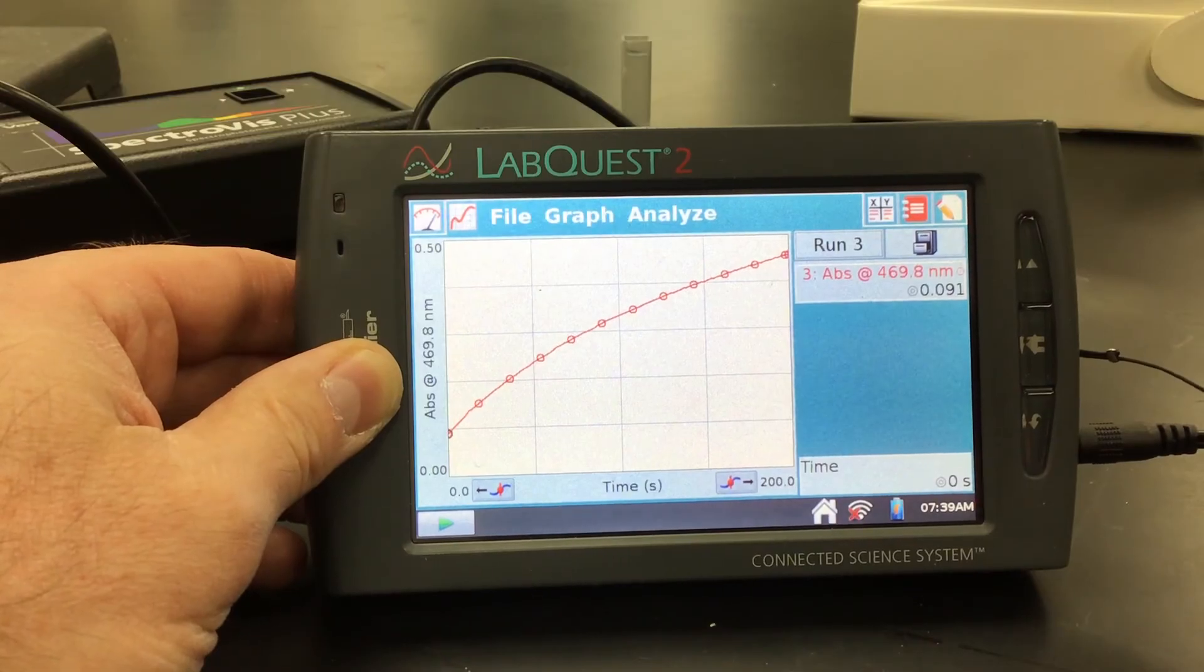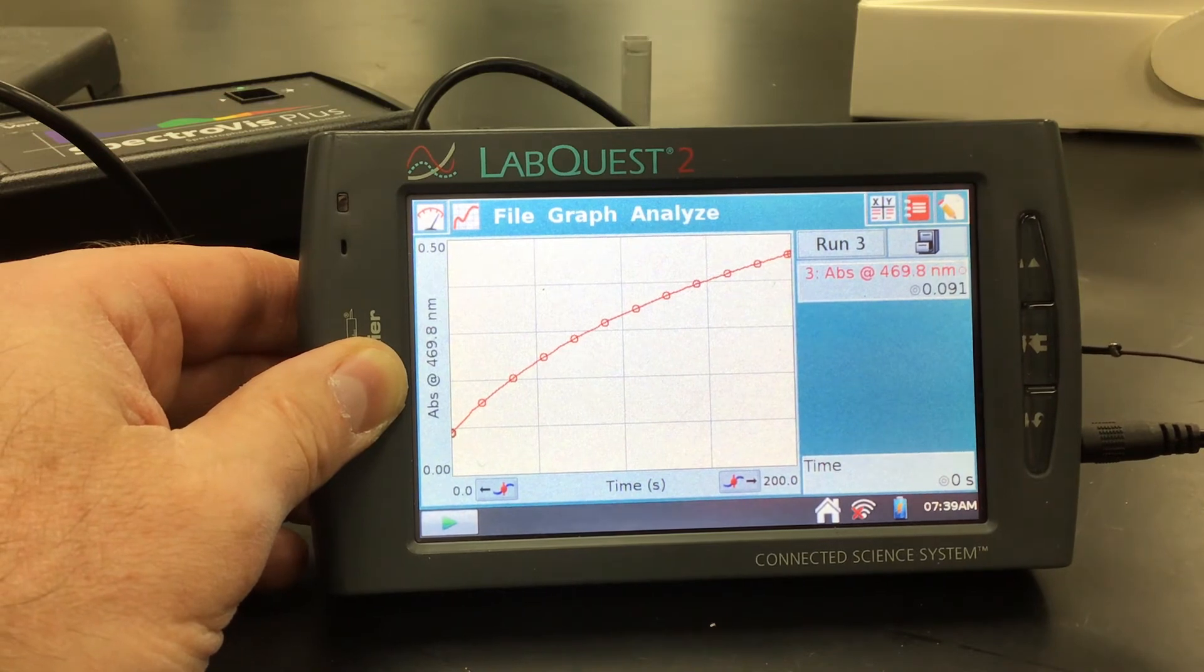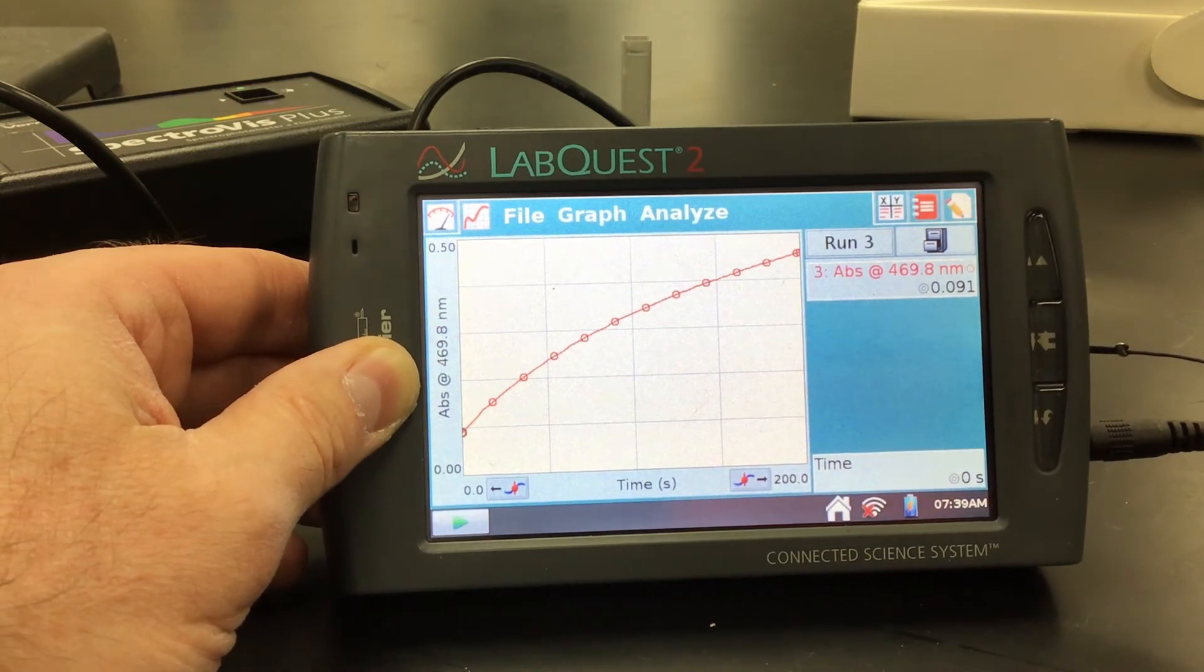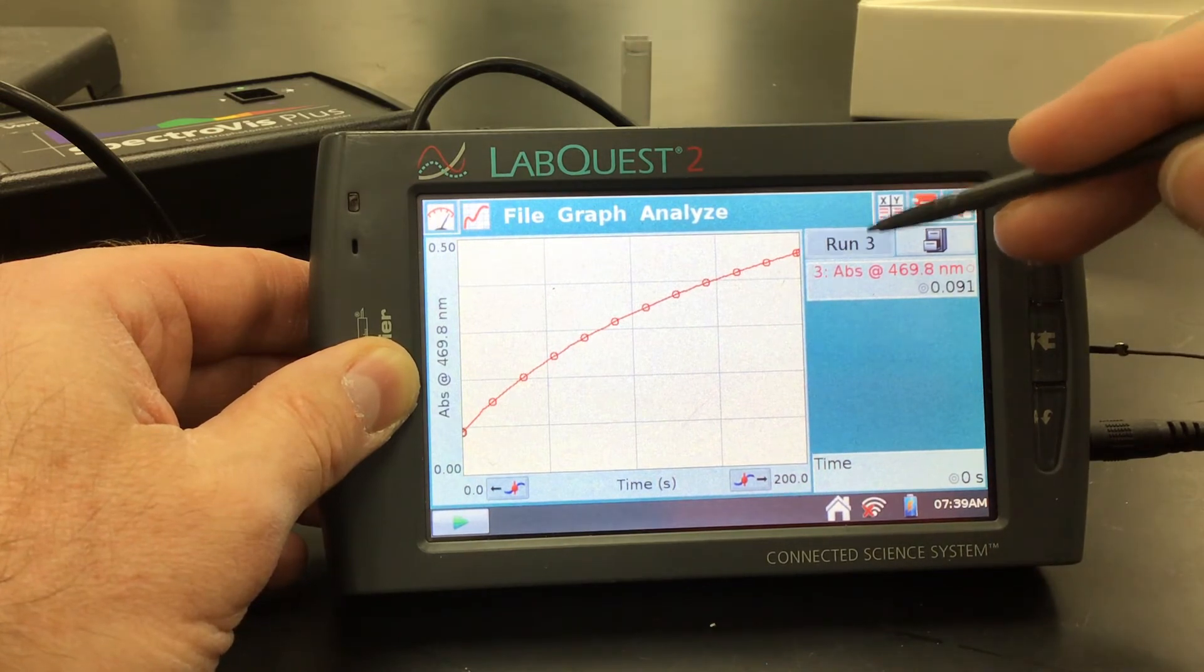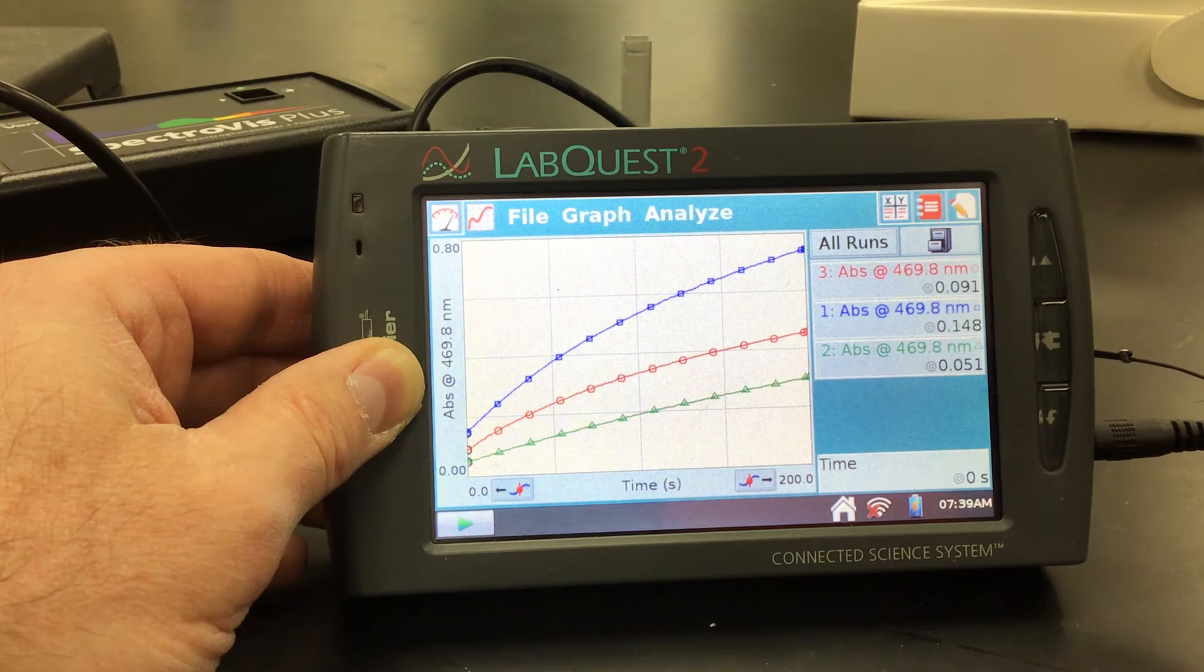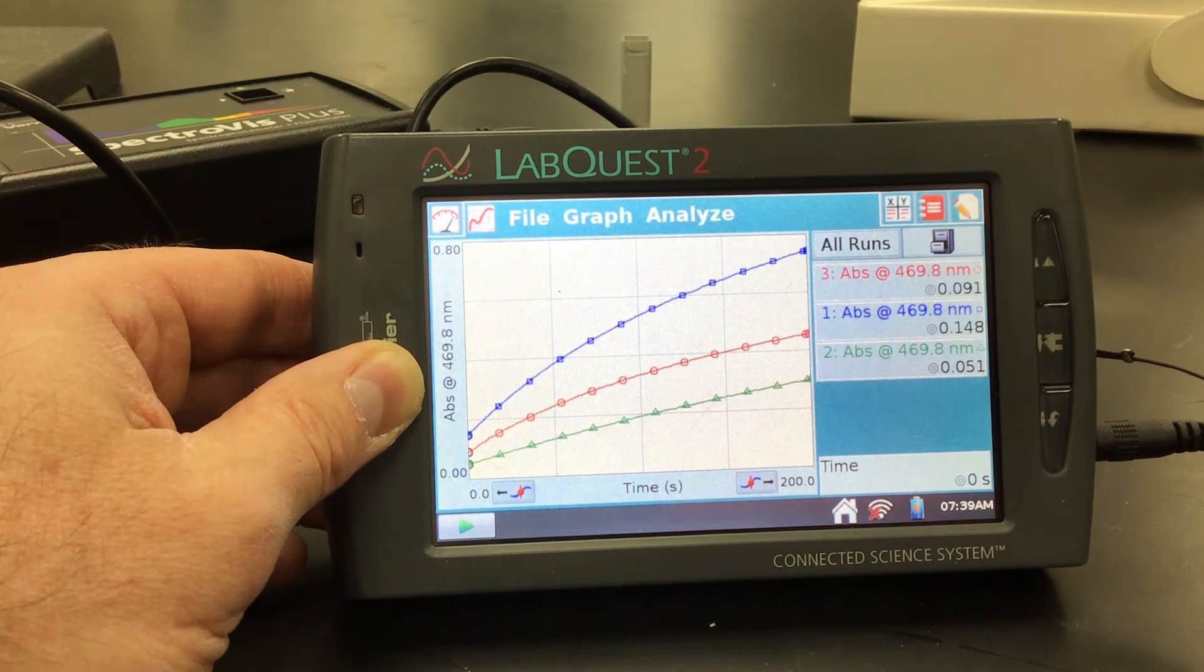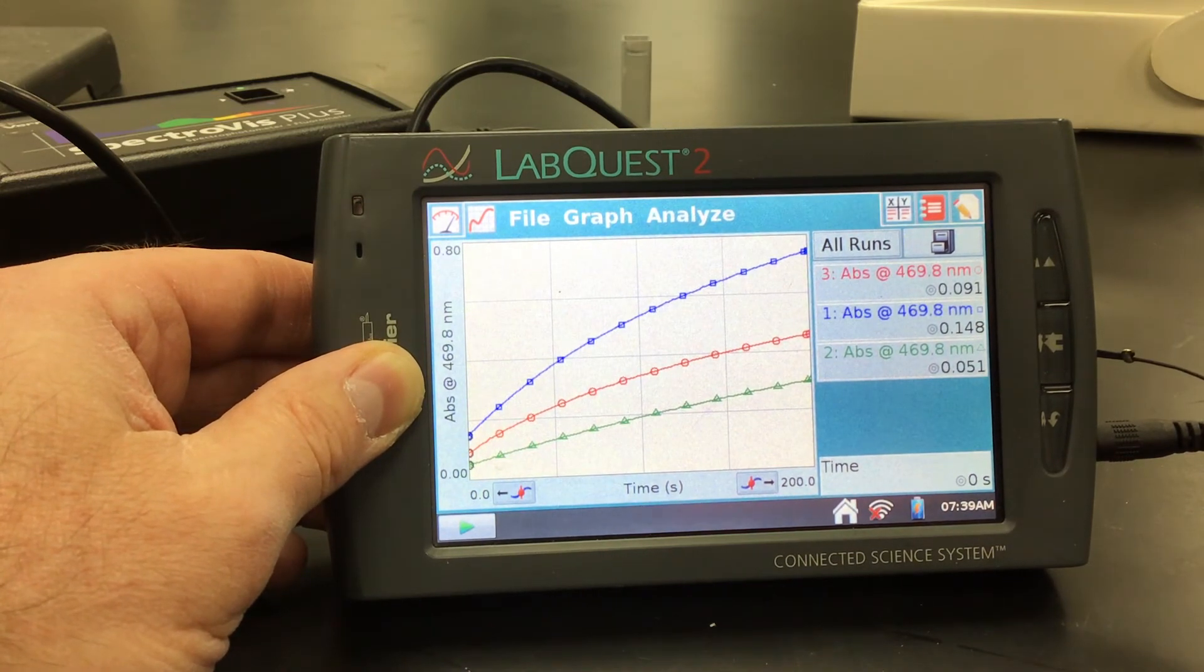All right, everybody. There's my third run, all done. And next what we're going to do is our analysis. So one thing that we can do to actually do all this is kind of show all three runs at the same time. And what we want to try to use and to look at is a linear portion of the graph that covers about 30 to 40 seconds of the reaction.